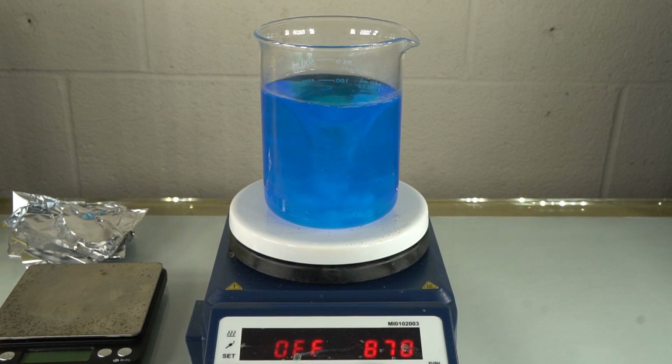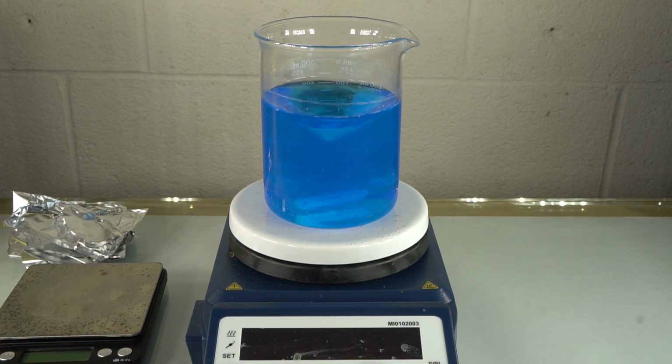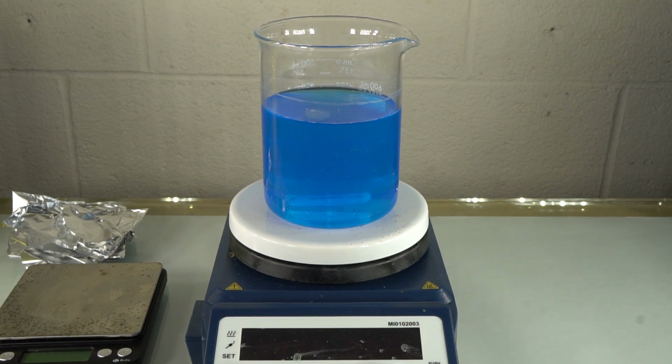And there we go. Let's turn that off. After just a few minutes, all the copper sulfate dissolved. And if you don't have a hot plate stirrer, you can stir it yourself and dissolve it. It just may take a few minutes. Copper sulfate is notorious for taking a long time to dissolve.